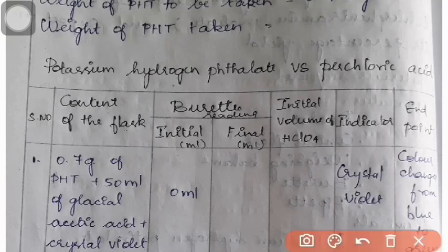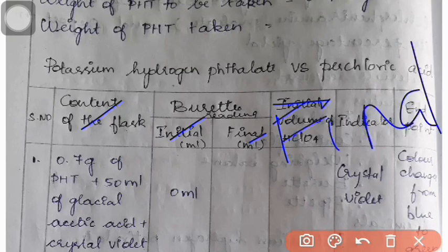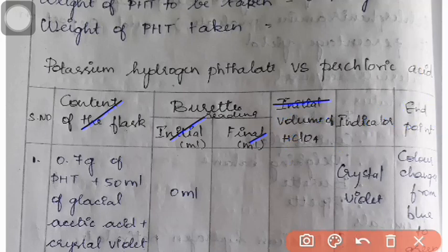We should have the contents of the flask, initial reading, final reading, and final volume, or otherwise we can say the volume of perchloric acid consumed.